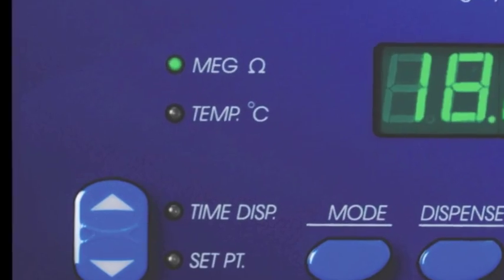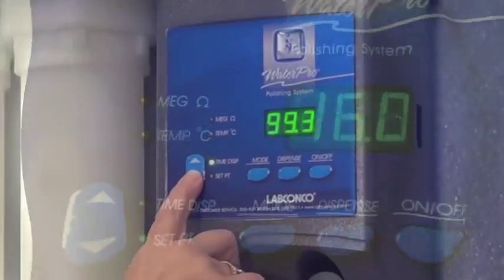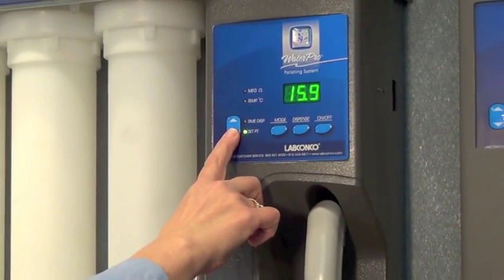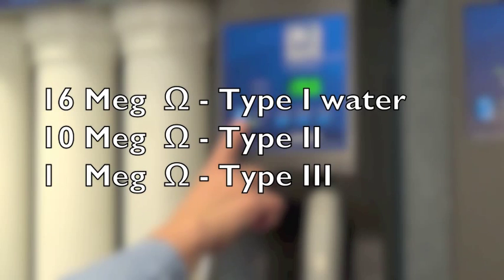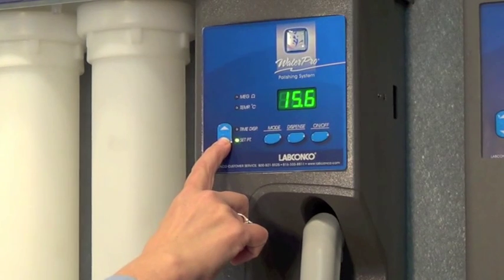The lights on the left indicate which mode is currently selected. Use the set point to display the minimum desired resistivity setting: 16 megaohm for Type 1 water, 10 megaohm for Type 2, and 1 megaohm for Type 3 water.